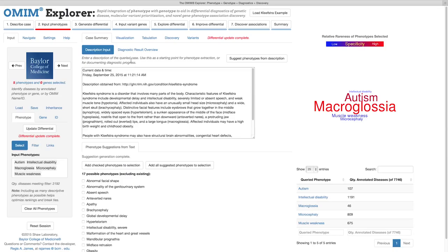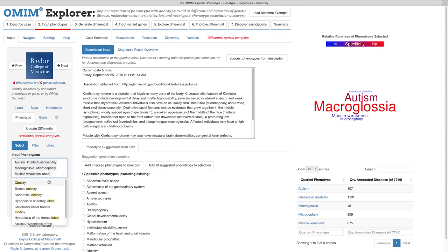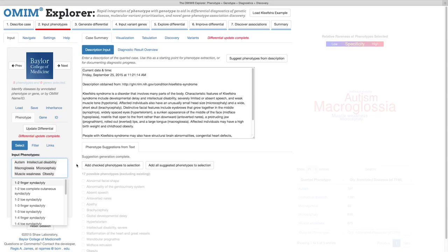Also note that the red line always indicates your current step in the workflow wizard. Since we're now on the phenotype input step, we can also manually select additional phenotypes. Note that OMIM Explorer automatically suggests phenotypes to complete the parts of words I type.